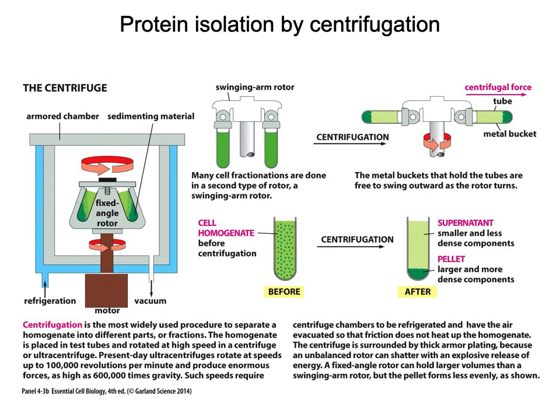And so if you look at the middle of this figure, we have this homogenate before centrifugation, and you can see all that liquid and all that material in there. And after centrifugation, what happens is any of the smaller, less dense components, kind of like the liquid of it, is going to stay up towards the top, and then what we would have is the pellet, and the pellet's going to be where our denser material is.